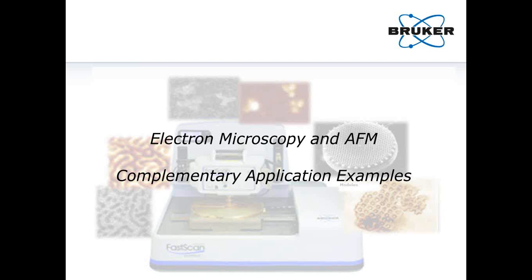After this brief update of how far AFM has come with regard to ease of use, performance, speed, and data interpretation, we will now look at some examples where both an AFM and an electron microscopy technique was used on the same sample type or application. This will give us a better feel for how the techniques are similar and how they are different or complementary.